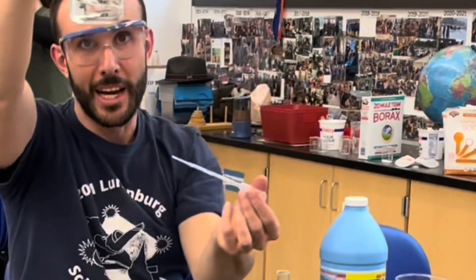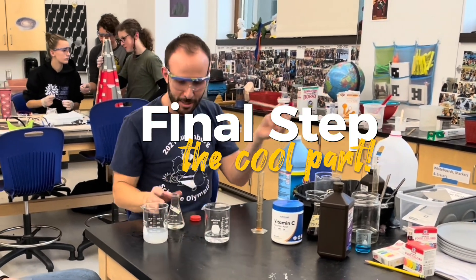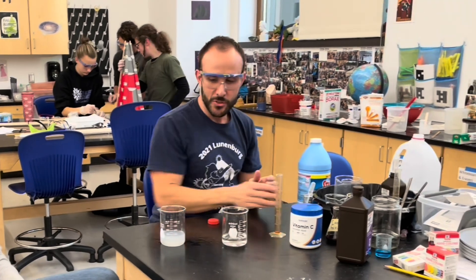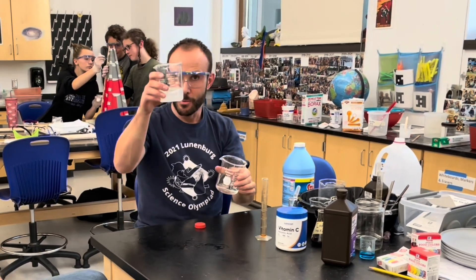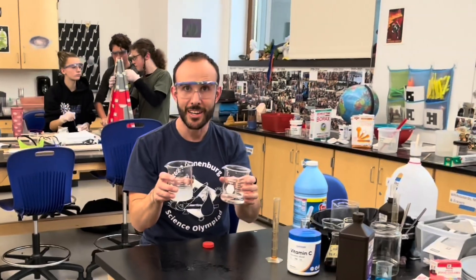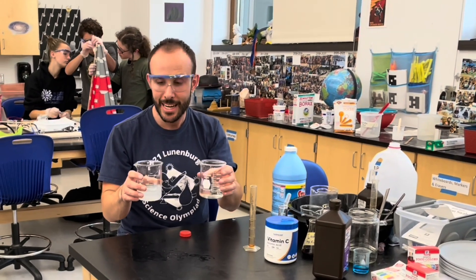Okay, so the iodine is now clear. Now Chloe's going to help me with the last step here, which is the combination. So we have our iodine solution, we have our starch solution, and we're going to combine them together, and it's going to be on a delay, so it's not going to react instantaneously.